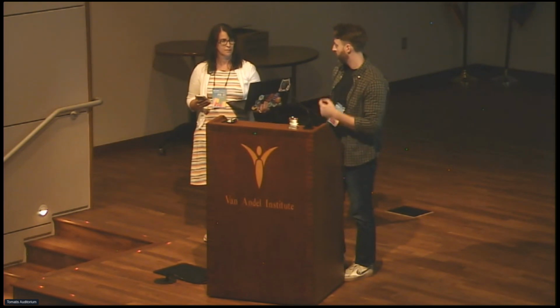One thing with Visium HD is the resolution can change. You could have 16 micron resolution, 8 micron resolution, or segment and get the individual cells. So the actual parameters and the size of the neighborhood will definitely need to change based on that. But something we're definitely interested in doing.